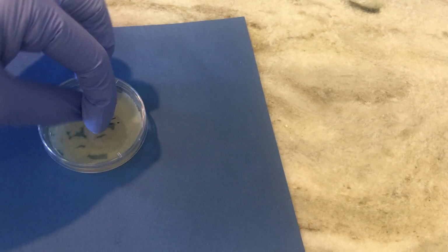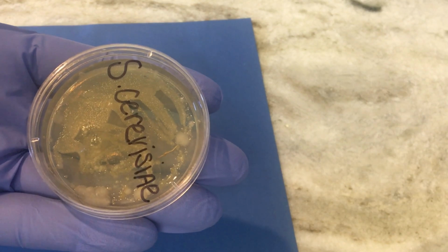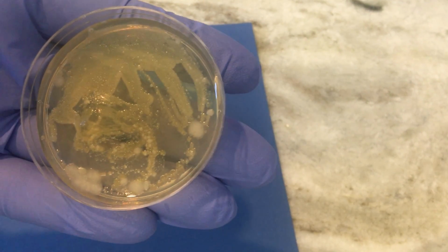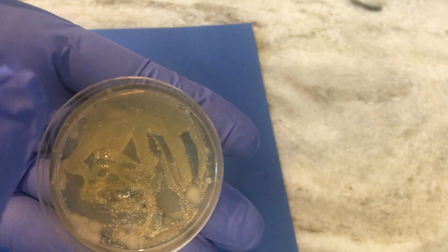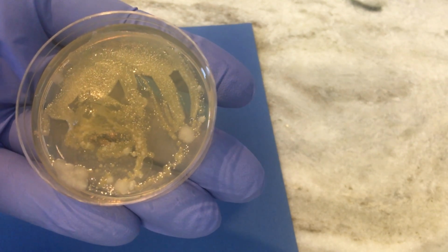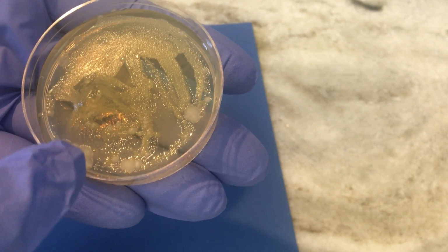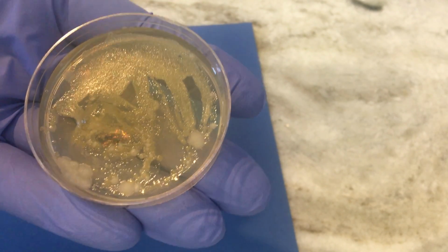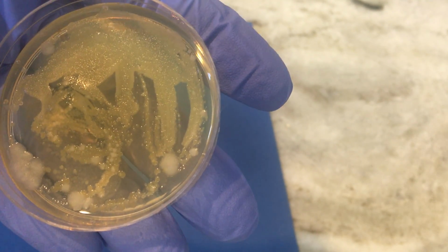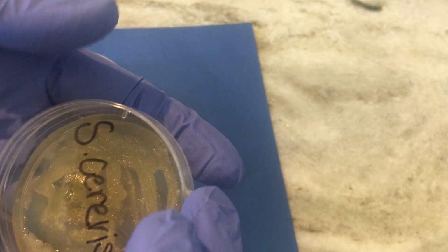There's the E. coli. And here is the yeast, which I guess is S. cerevisiae, I believe. So you can see the yeast has grown. You can kind of see my pattern, thick there, and then I spread it out, and then here's the dots. However, notice that these are whiter right here. These are whiter and a little different texture, possibly contamination. Not too sure. Could be though, because it could be a different bacteria, right?